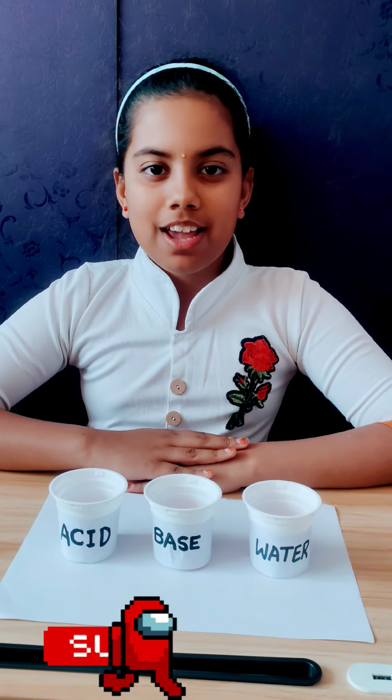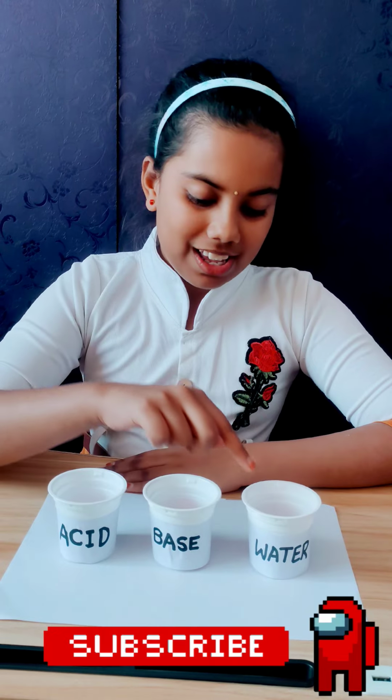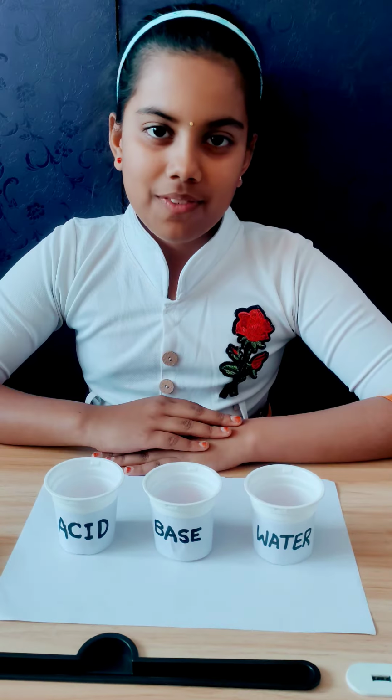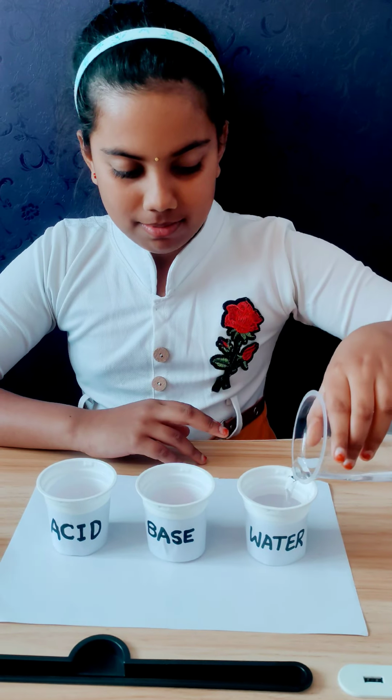Rishika Lakshmi. Today I am showing how to identify the differences between water, base and acid using litmus paper. First I am taking water. Now I am preparing base with water and surf powder.